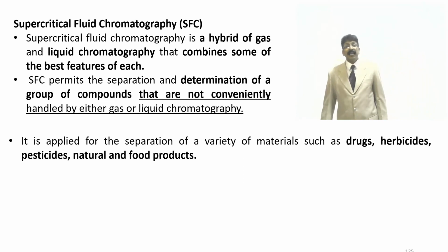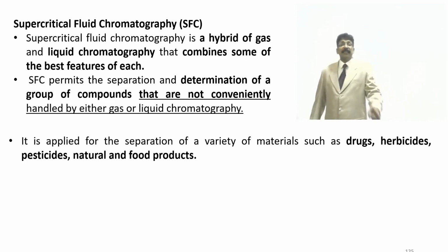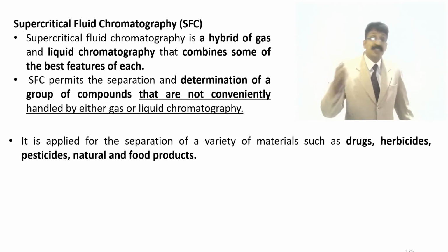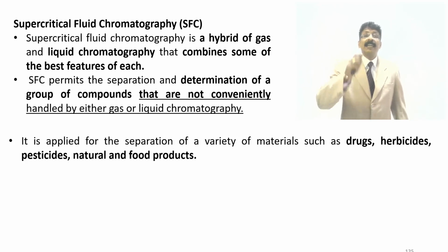So it is applied for the separation of a variety of materials such as drugs, herbicides, pesticides, natural and food products, which can be easily separated by means of this SFC, supercritical fluid chromatography.